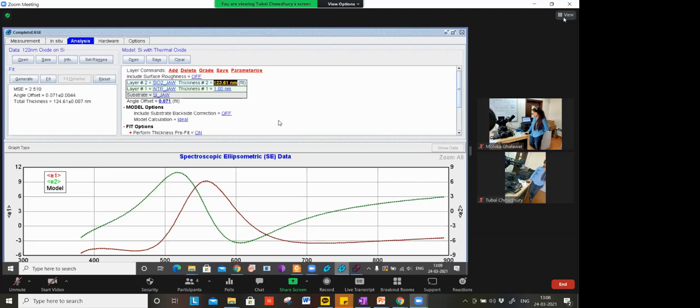Okay. So in the end, I just want to tell you a few things. Since there were so many questions regarding tungsten, and one person is still asking about tungsten: since you are working in this area, you are saying that we should use Cauchy and everything.